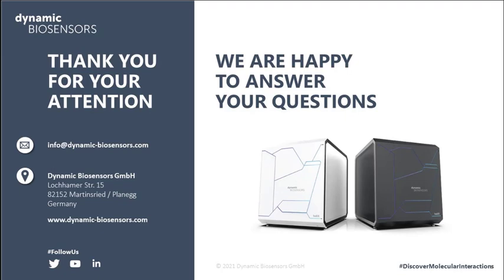So we monitor the presence of ligands on the surface using the fluorescence signal. Our photon counters are highly sensitive, which means that we can work with very low ligand densities, achieving target separations of approximately 300 nanometers on the surface. So we can go to very low densities. Here we don't necessarily express it in terms of a concentration because we're already working on a surface, so it isn't a quantification in that sense. We talk about the interligand separation that you can achieve, and this is down to about 300 nanometers.